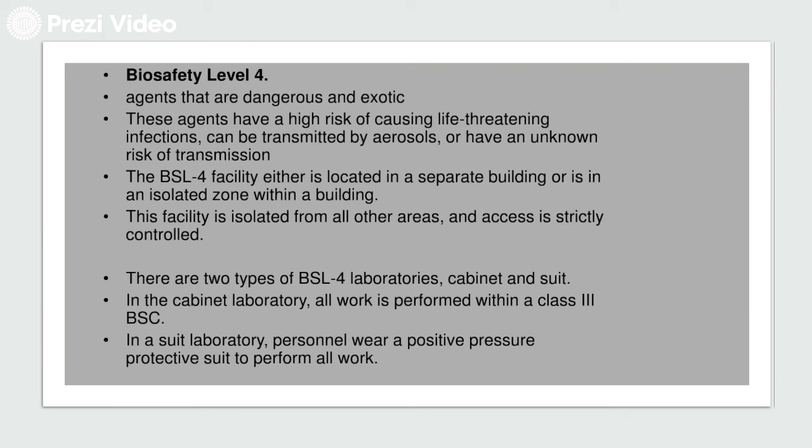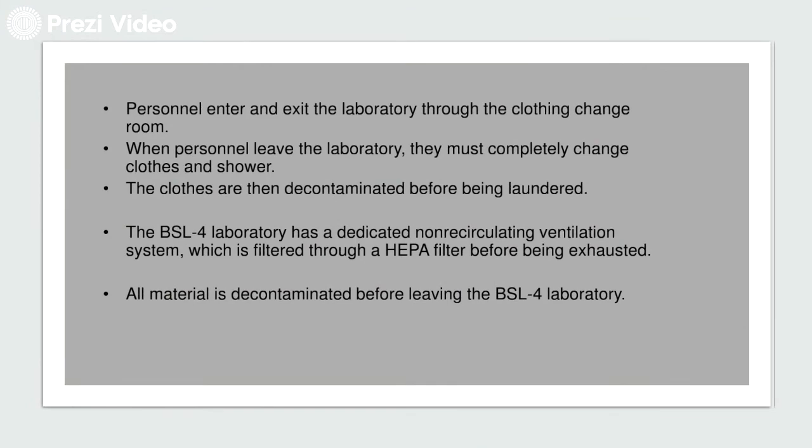So, again, for the level 4, the facility either is located in a separate building or in an isolation facility. And then, access is strictly controlled in the area. Hindi basta-basta makakapasok dyan. So, ito yung mga microorganisms na life-threatening, can be transmitted by aerosol, or have unknown risk of transmission. So, yung mga exotic and dangerous na hindi mo pa naaaral na microorganism. So, kapag bago yung microorganism, pasok mo na siya sa biosafety level 4 para pag-aralan siya.